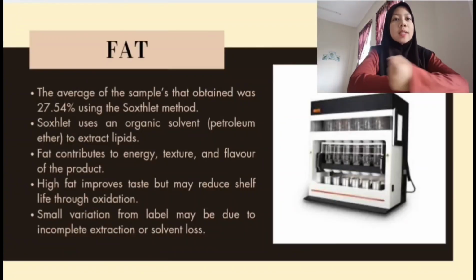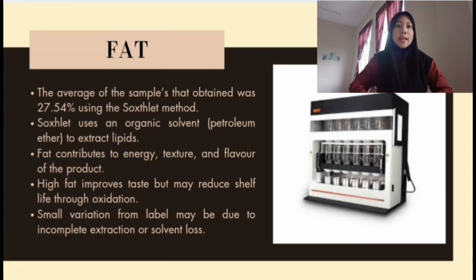Next, I will explain about the fat analysis. So, the average fat content of our sample was 27.54%, which was determined using the Soxhlet method. So, this method uses an organic solvent, usually petroleum ether, to extract the lipids from the sample.